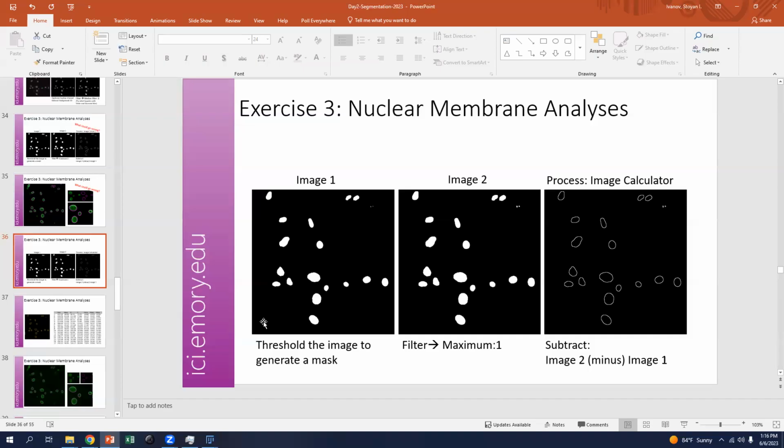Oh yeah. Okay. This one has 3 ones. No. This, okay. Tracks. This is way easier. So now I'm going to tell you if you get this. It took maybe, yeah. I don't think, okay, then maybe this is just another way to do it. But this is still how you do it.